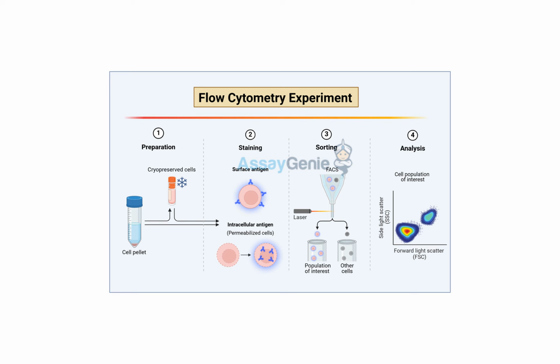That's very cool. But it sounds like choosing the right fluorochrome is pretty important. It is. We need to make sure it works with our equipment, and it doesn't overlap too much with other fluorochromes that we might be using. Because we might have multiple antibodies in there, each with a different tag. And we don't want those colors to get all mixed up. We don't want it to be a big mess. It would be like a painting where all the colors have run together. Exactly. How do we prevent that?